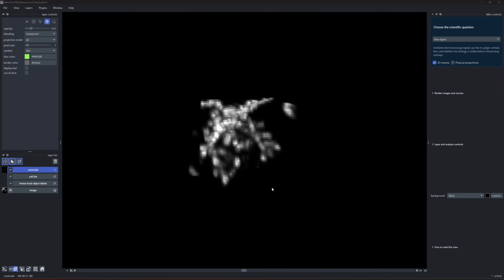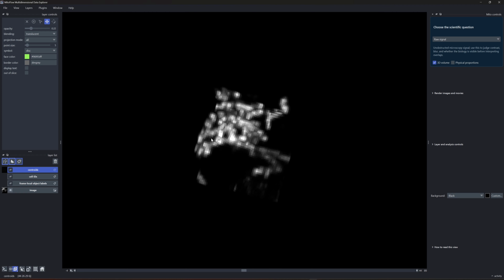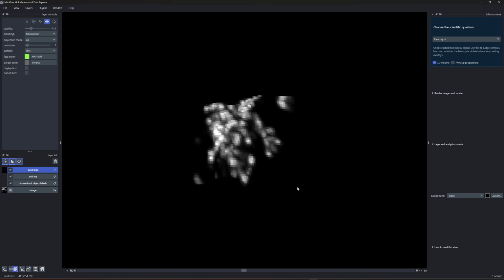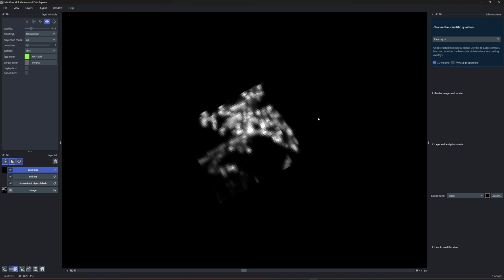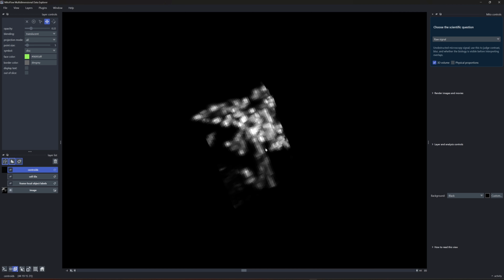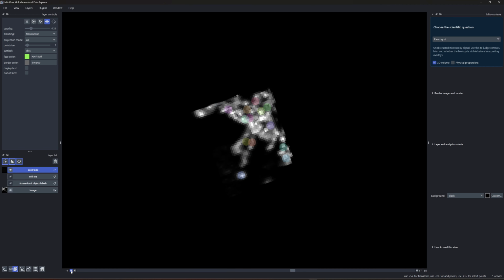In this video, I'm going to be talking about 4D mitochondria analysis. So here's a situation that some of you who do 4D mitochondria analysis, or any sort of 4D analysis with microscopy images, would be aware of. So here's an intensity image, and this is a 4D volume. Okay, so this is what it looks like overall.